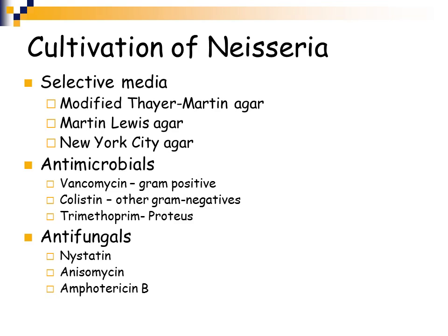The board exams also will ask you questions about media, because we as medical laboratory scientists are expected to know, if I think I have this group of organisms, I need to know what media they can and cannot grow on and why. So you definitely need to know about modified Thayer-Martin agar.